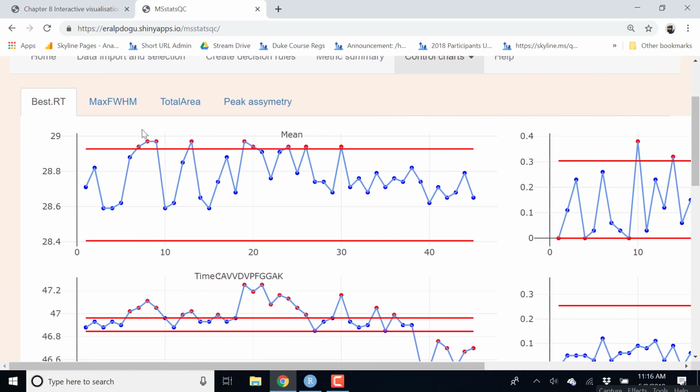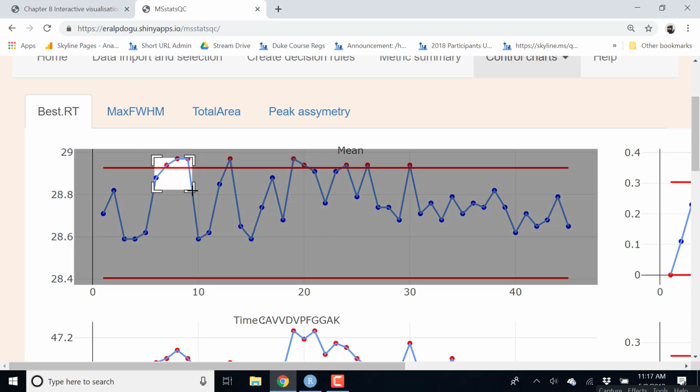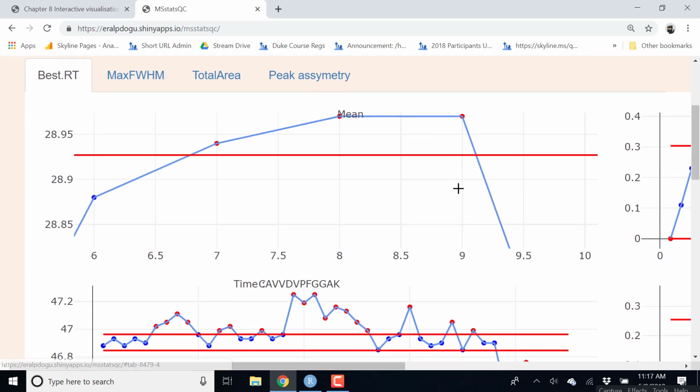And when the system performance is not good, the dots appear as red, which are out of the expected boundary for the data. And as you see, they are all interactive. You can hover around, see the exact value for the x-axis, and then again you can zoom in to a specific part of the data to see more detailed information.